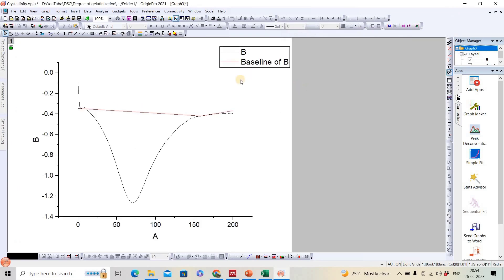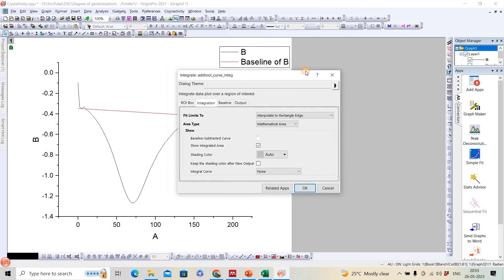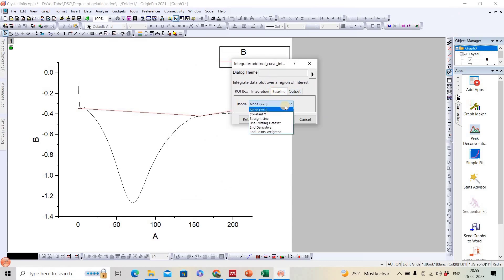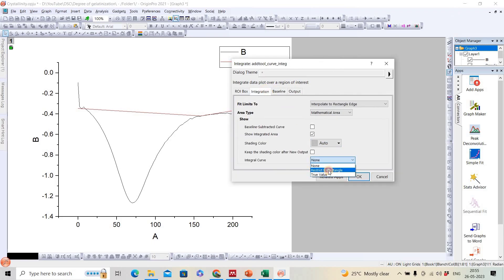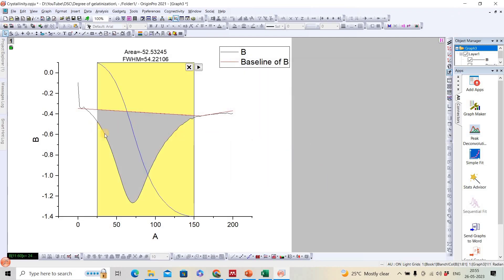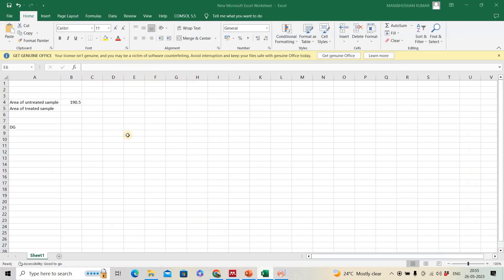We finish the baseline and go to Integrate. We select the newly created baseline and choose 'restrict to rectangle', then click to apply. The area under the blanched sample curve is 53.38.